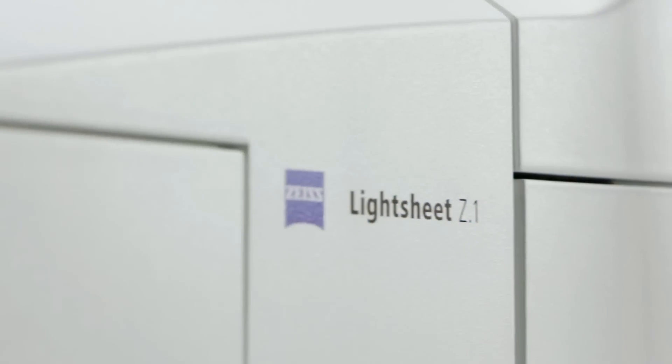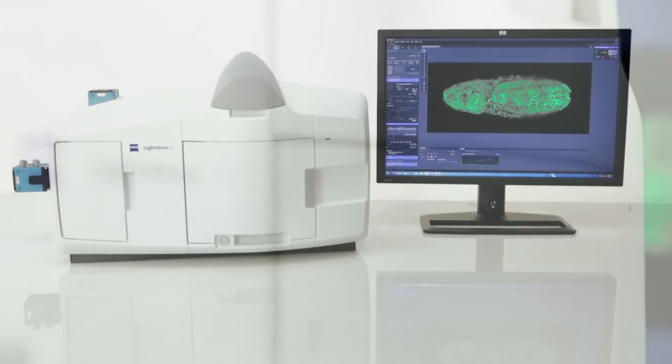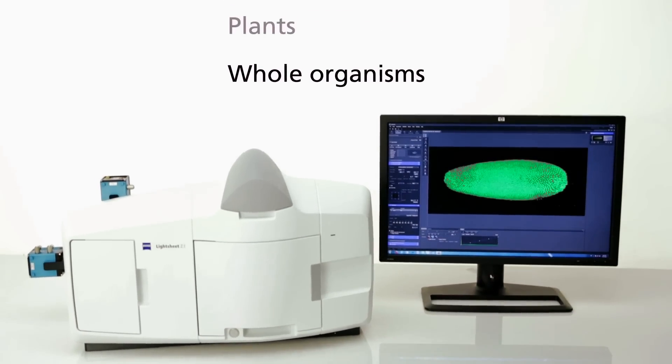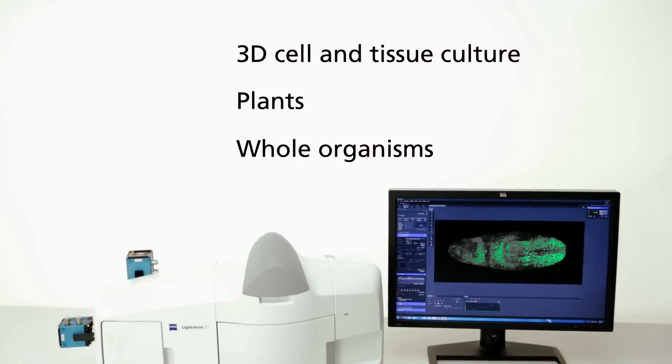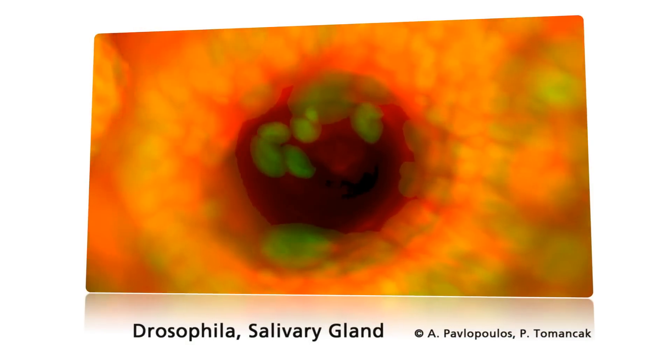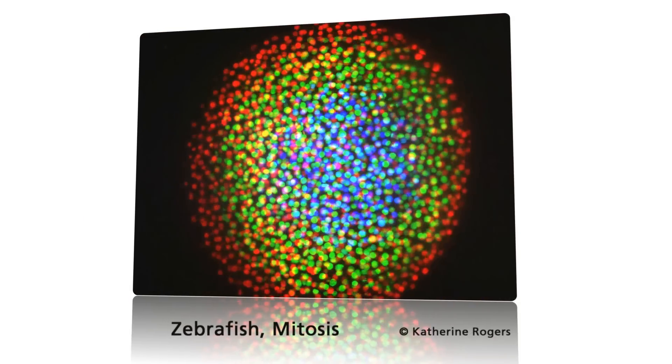Do you want to prepare your model organisms for imaging with LightSheet Z1? With the following simple steps, you will get perfect results with samples such as Drosophila or Zebrafish.